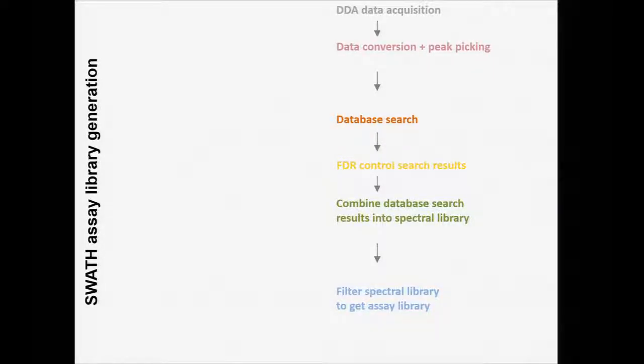What you'll find is that when you do these types of experiments, you have redundant peptide spectrum matches. By that I mean you have multiple instances of spectra that identify the same peptide. There was a bit of discussion about this already: you have to decide, if I have 20 spectra for one peptide, what am I going to do with these? Because I only need one representation of this peptide in the library.